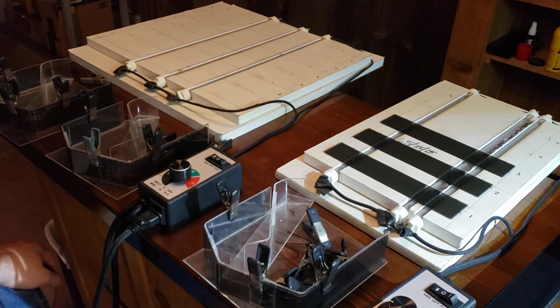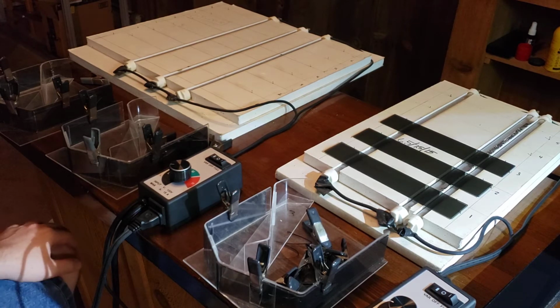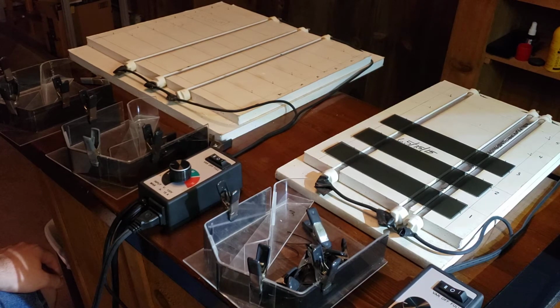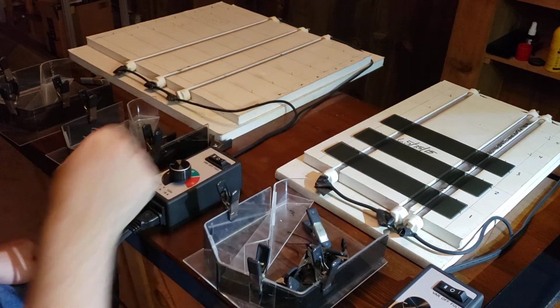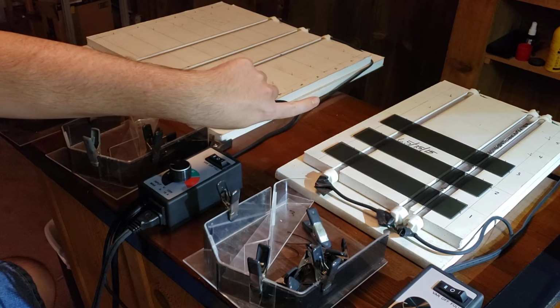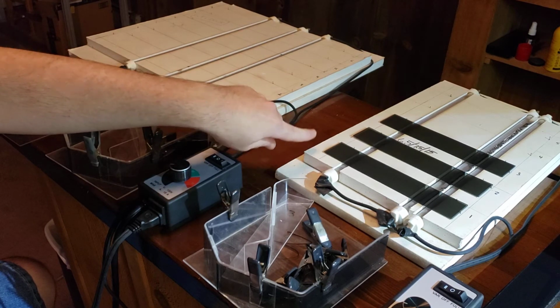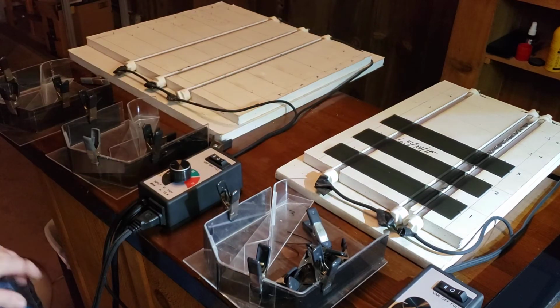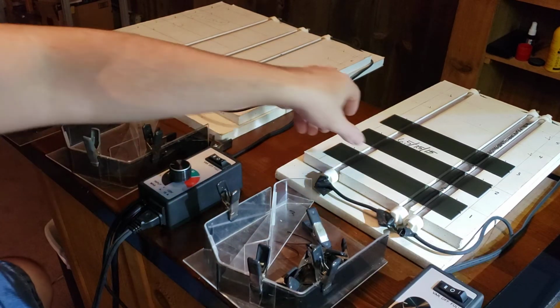These thermostats I got, well, not thermostats, probably rheostats, I got those on Amazon. Work really nice. And the acrylic, you actually watch as it starts to heat, it'll flex up and it'll flex back down once it's heated. That's the acrylic relaxing. You can see the heating element does get a little bit red the longer we run it.